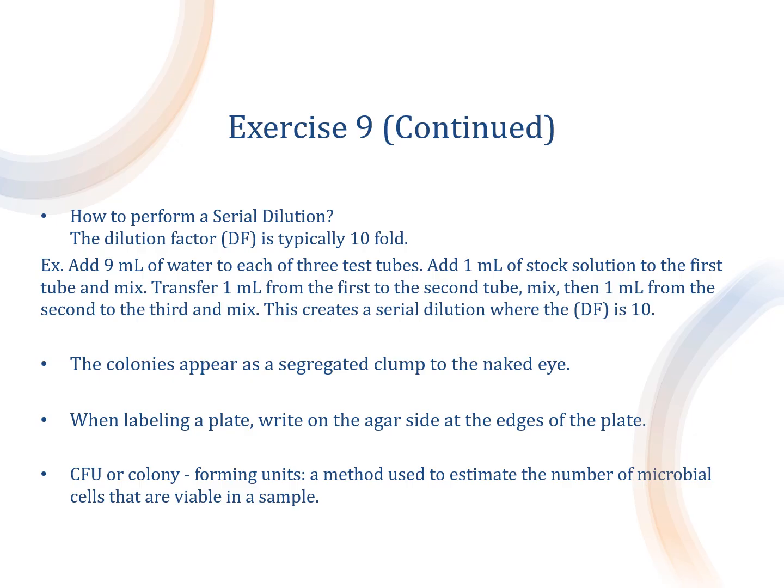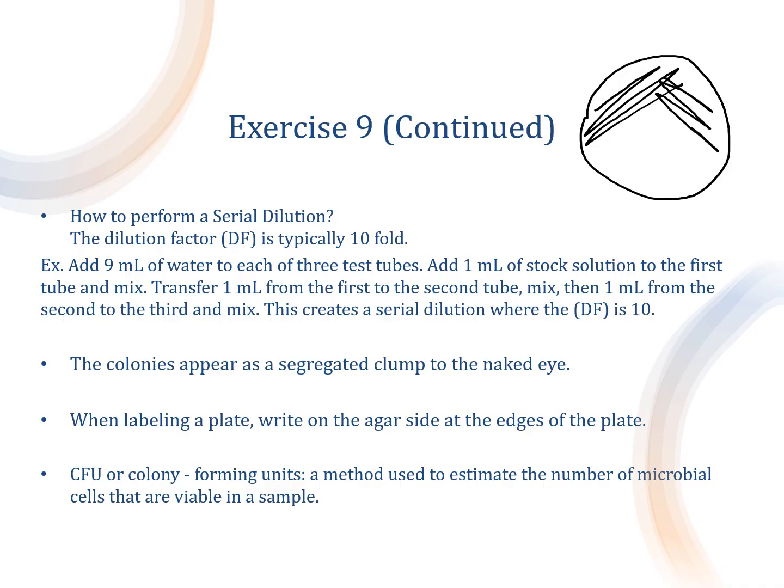And then what is the purpose of a streak plate? So like you saw earlier, the streak plate is just you're swiping the bacteria and you're constantly reducing the numbers of bacteria that will form as you swipe it. So the whole point of the streak plate is to just get isolated colonies of whatever bacteria you're using.